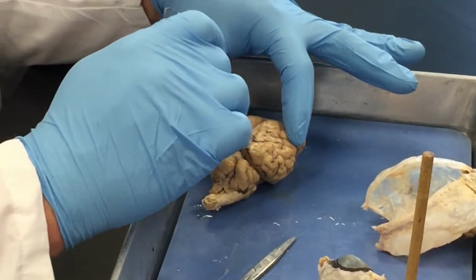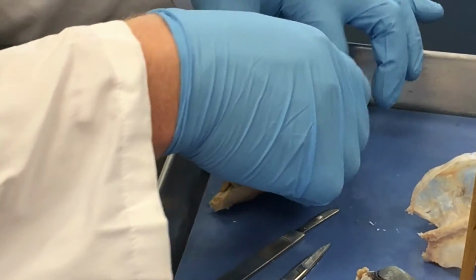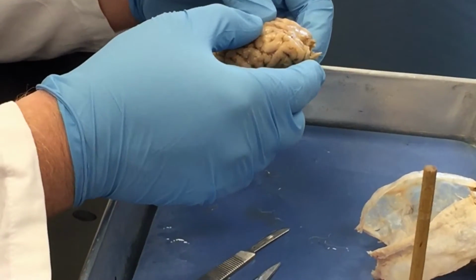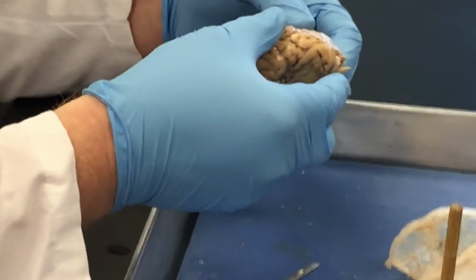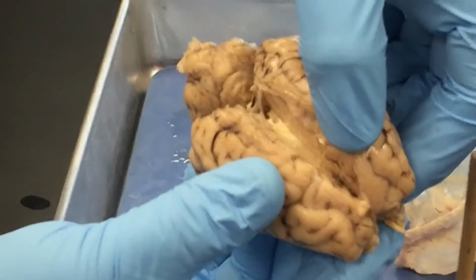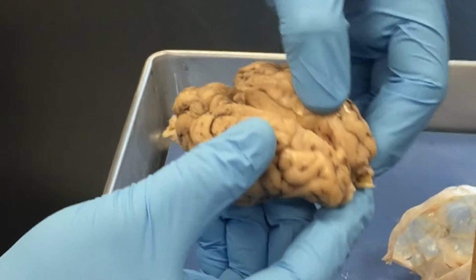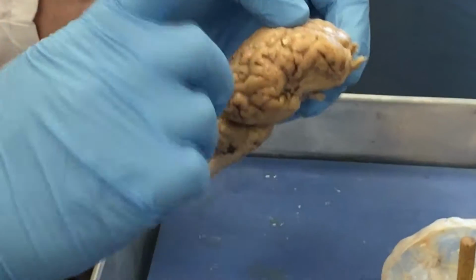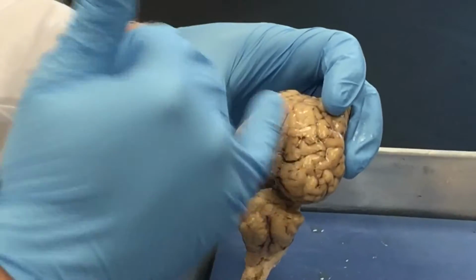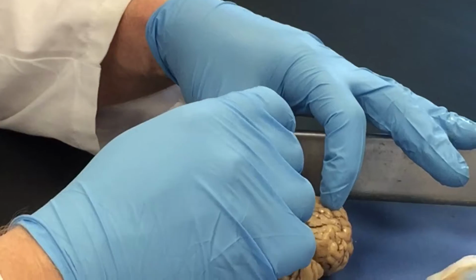Separate the two cerebral hemispheres. So I open that up and it's starting to tear a little bit already, so I'm not going to pull too hard. You see where it kind of turns white in the middle there? Brennan, do you see that? Where it kind of turns white in the middle and it's tearing a little bit? That is the corpus callosum, that commissural tract that goes between the two hemispheres. When somebody has a seizure disorder, a lot of times they'll cut that so that the hemispheres can't communicate anymore. That causes a lot of problems, obviously, so it's only done in extreme cases.